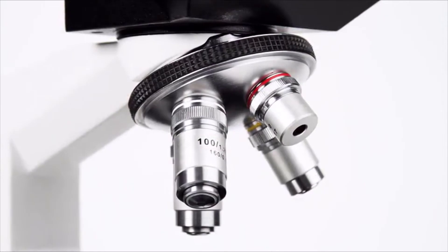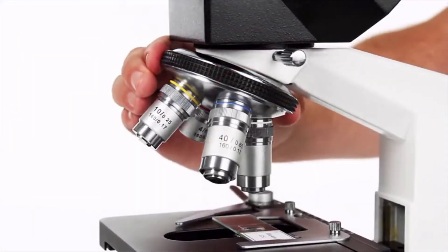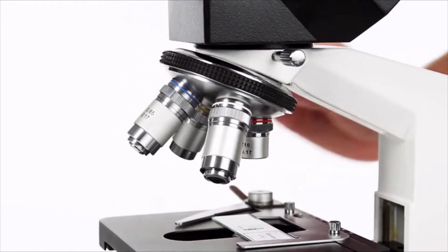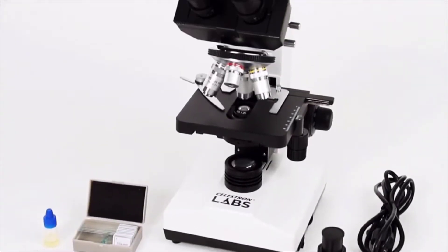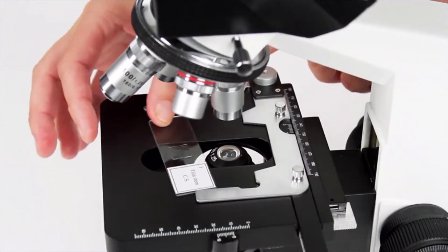Inside, you'll find Celestron's signature optics. All glass objectives provide sharp views with excellent detail. All seven models in the Celestron Labs family include prepared slides or 3D bug specimens to get you observing right away.